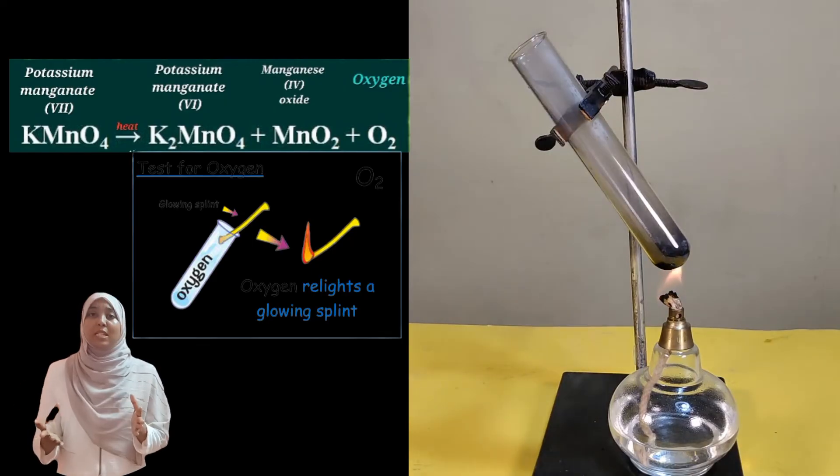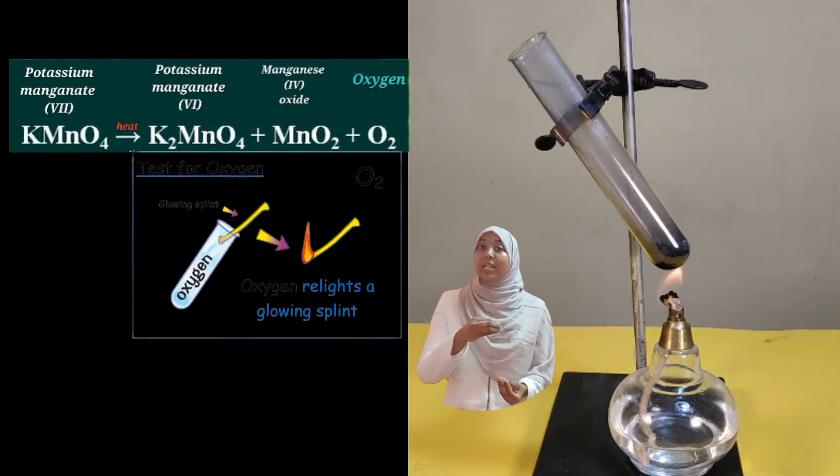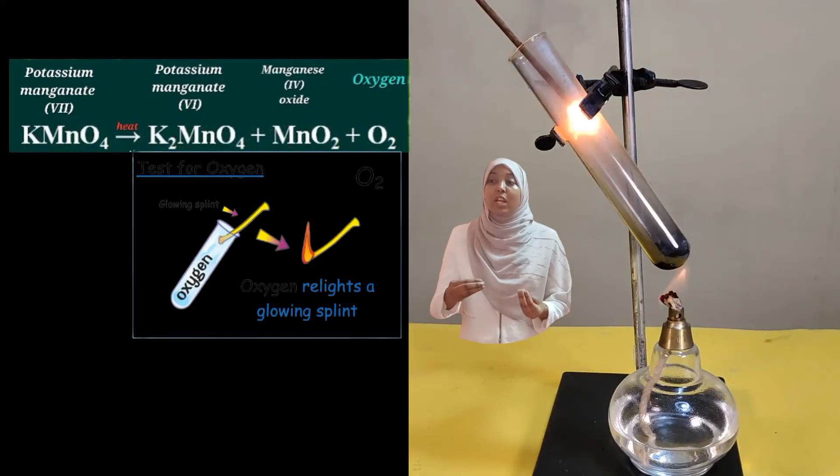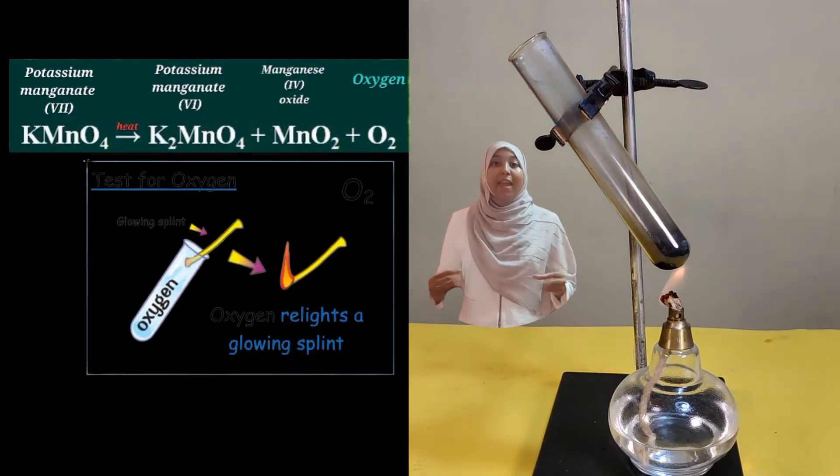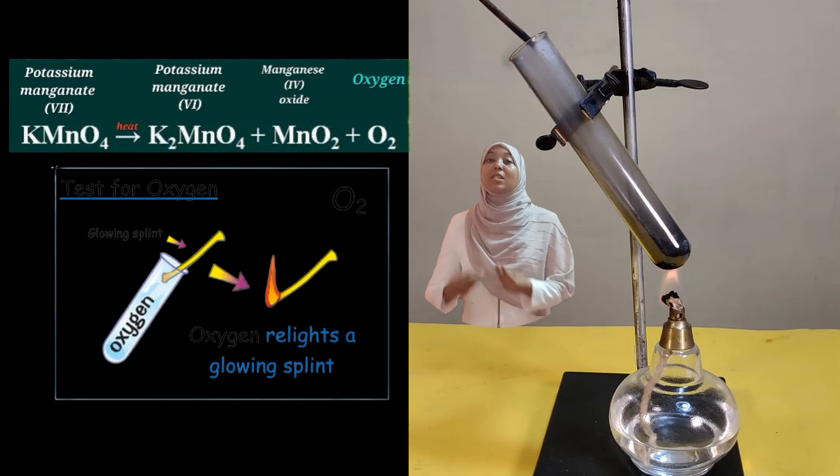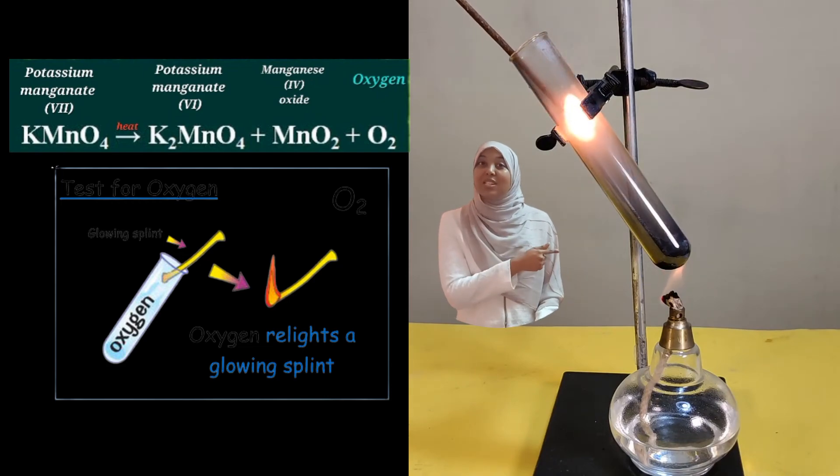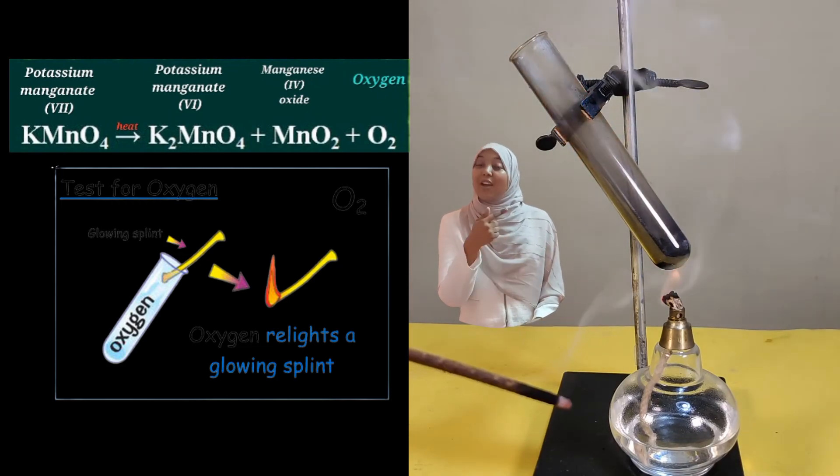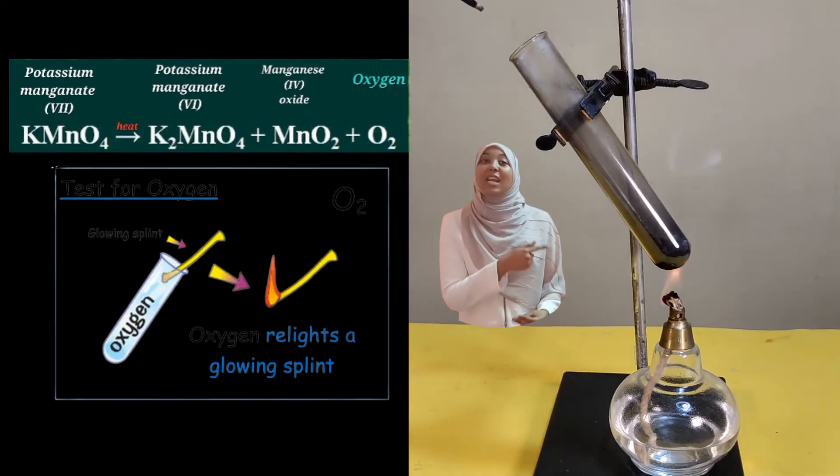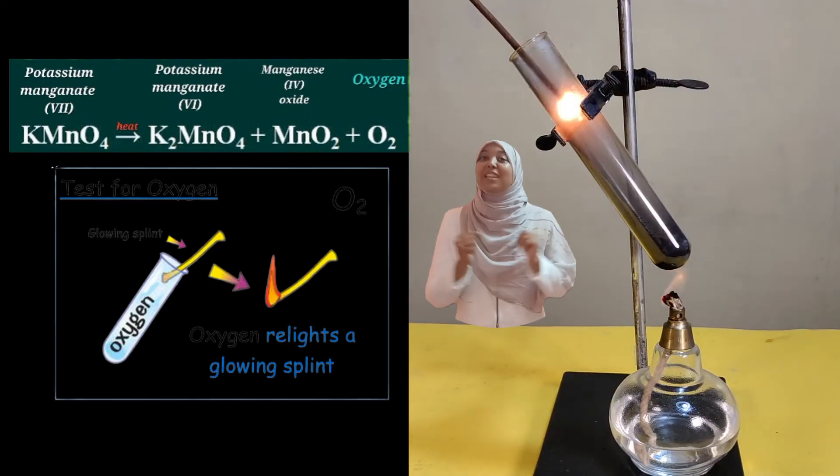If you introduce a glowing splint in a container having oxygen, it's going to relight. If it relights, then that is the positive test for oxygen, such as what is happening in this case. We are having oxygen that has been produced, and that is the reason why it relights the glowing splint.